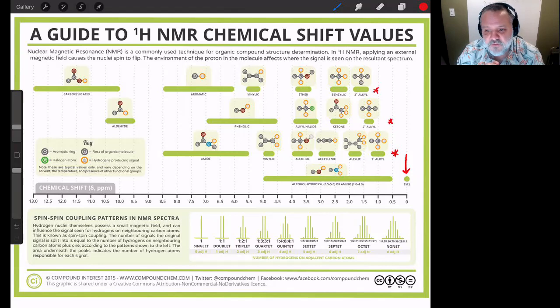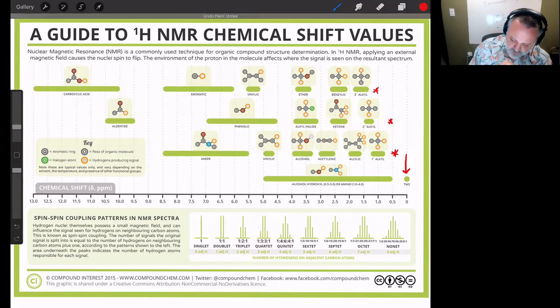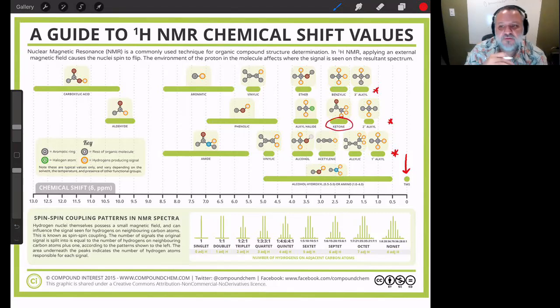So there are some other signals in this territory that are particularly helpful. You can see that where a particular motif appears isn't necessarily shared by a lot of different things. So for instance, the ketone would only overlap with benzylic hydrogens.